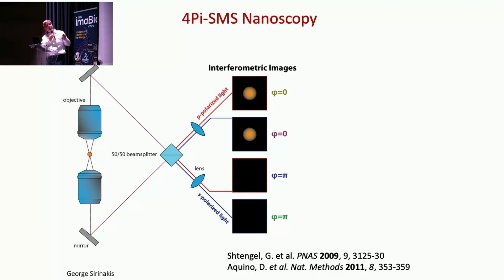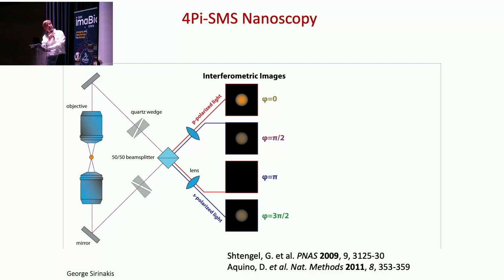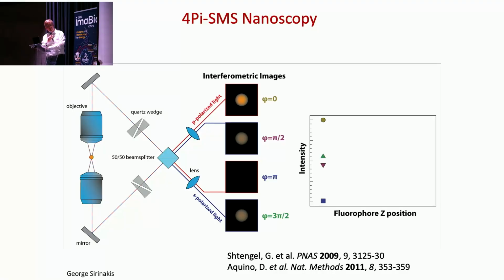we can look at different polarization directions, and there's a little trick we can play by putting a birefringent quartz wedge in here, and that means we can shift the interference of one polarization direction a little bit versus the other. So this would be now perfect constructive interference, 0-degree phase shift. This is the 180-degree phase shift, and here would be 90 degrees and 270-degree phase shift. So we get these four images out fairly easily now with this beam splitter cube and this birefringent element.